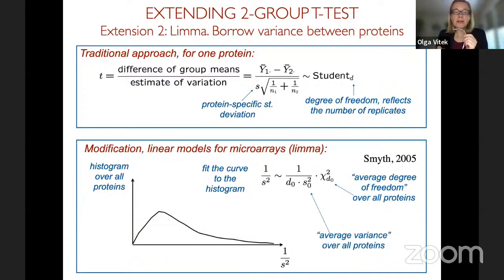And so Limma is really helping with the stabilization, but for many experiments in proteomics, especially in multiplex proteomics, the signal part of Limma is actually not quite adapted to what we would need. And so what MSstats is doing is using the same ideas of stabilizing the variance denominator, but it models the signal separately, specifically to the needs of quantitative proteomic experiments.